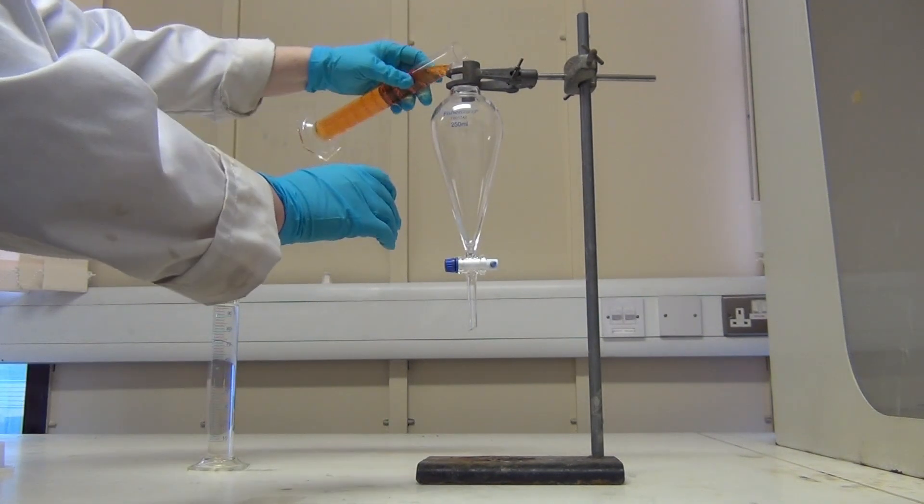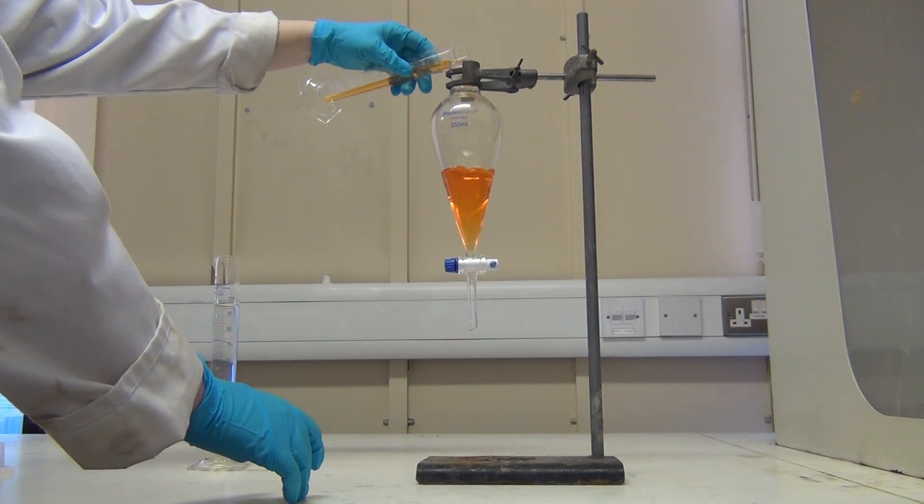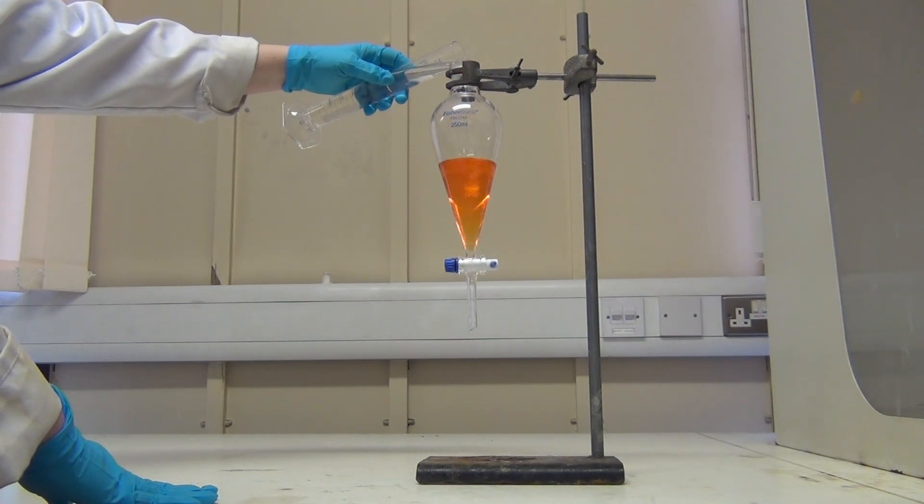When pouring liquids, you may wish to use a measuring cylinder or long-stemmed funnel to prevent spillages. When both the solution and the extraction solvent have been added, layers will begin to form.